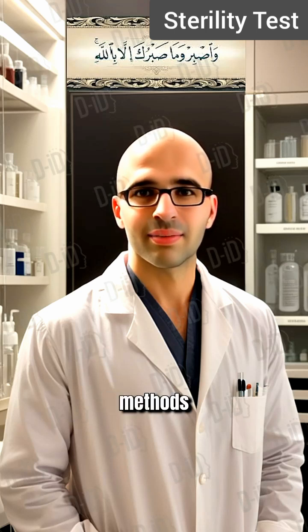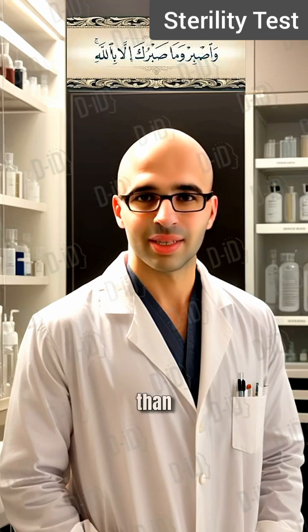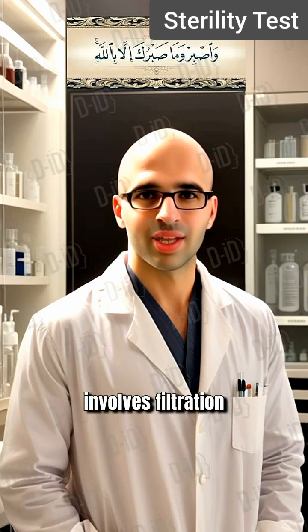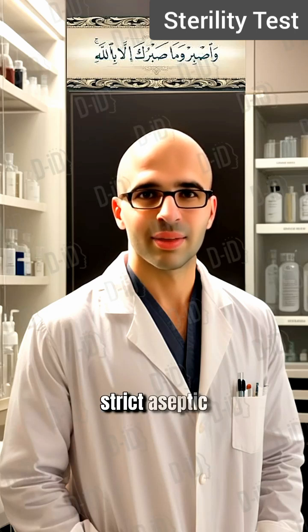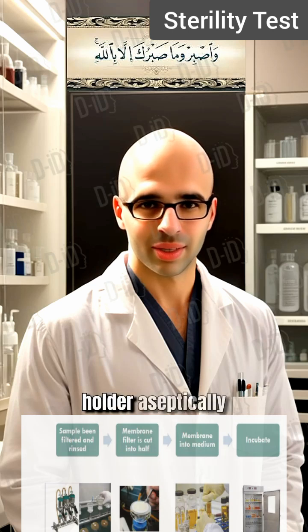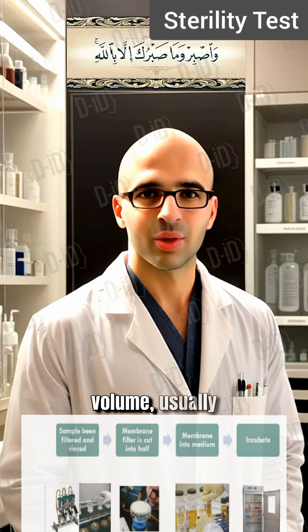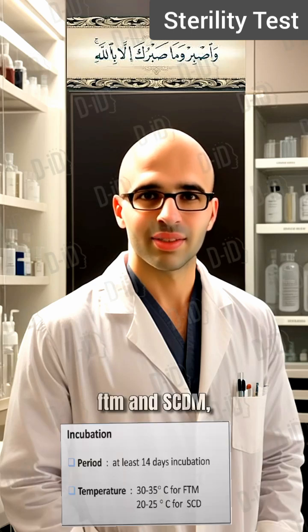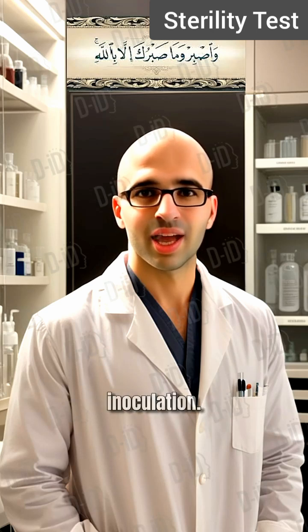Sterility test methods. First method: a membrane with a nominal pore size not greater than 0.45 micrometers and a diameter of approximately 50 millimeters. This method basically involves filtration of the sample through membrane filters. The filtration is performed under strict aseptic conditions. After filtration is completed, remove the membrane from the holder receptacle, cut into 2 halves, place each half in a suitable volume, usually 100 milliliters, of FTM and SCDM respectively, and incubate.